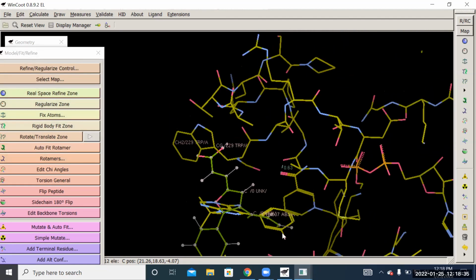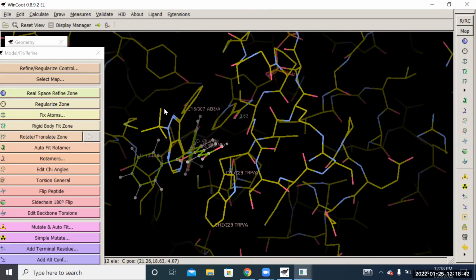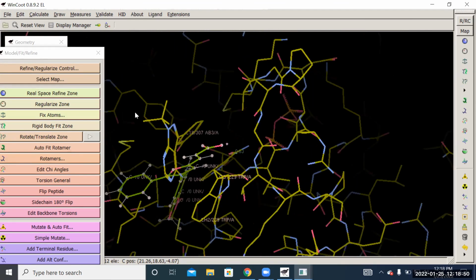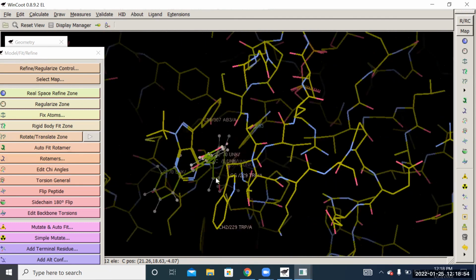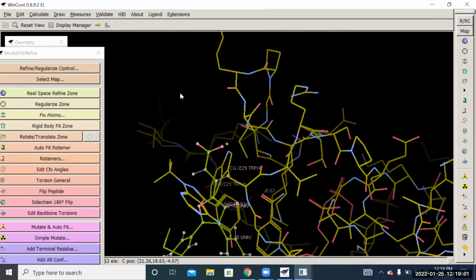That may be the ticket. Do you see how I did that? And I was able to move that. Now, let's say I love this, which I don't, but let's say I did. Let's say you got to the end point, you're like, okay, it's positioned where, after talking with Henry, I know where he thought certain things I should be trying to do. Great, I did it. I feel happy.